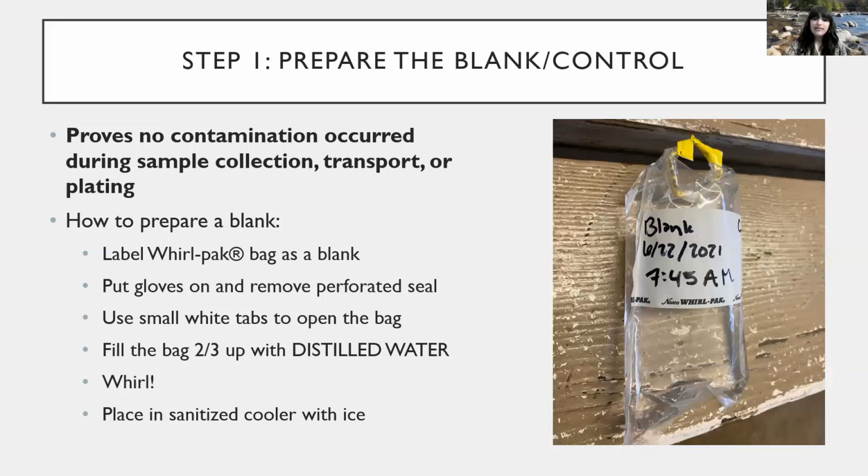Then you're going to place your blank into a sanitized cooler with ice. And remember, this is going to be the same cooler that's going to hold the other samples from your monitoring site. So you only need 1 blank per cooler, but you can have samples from multiple sites in that same cooler. We just like to note that in case volunteers are monitoring more than 1 site.